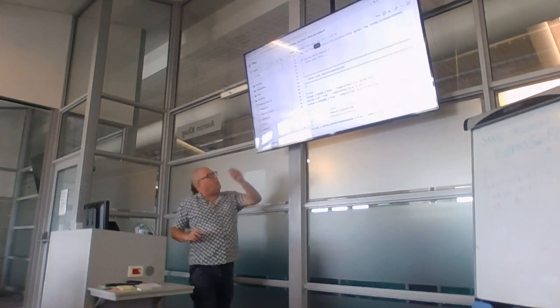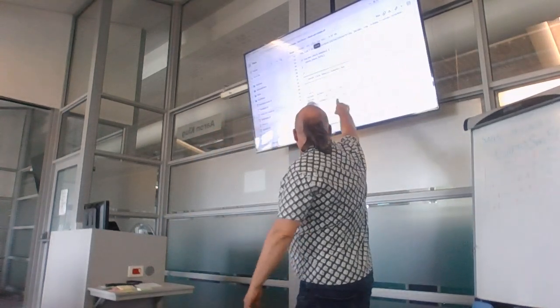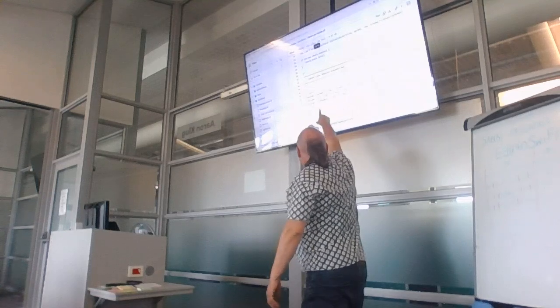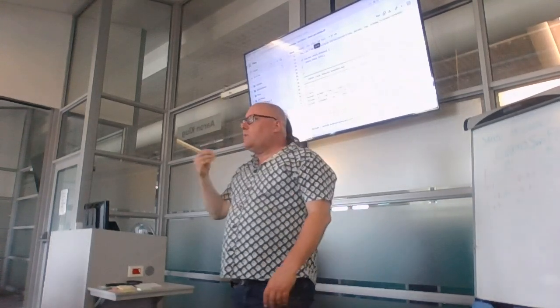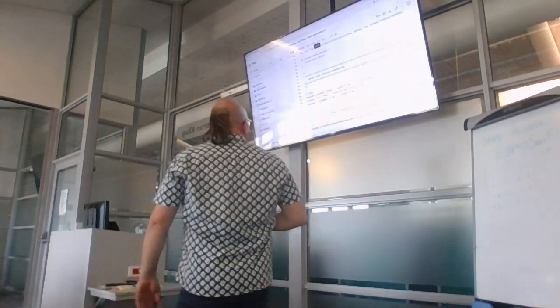It says import local workflows, okay? So it says here include gather from, and there's a name, include QC from, and there's a name, include scrubber from, and there's a name. So it's got three different modules that it's importing called gather, QC, and scrubber, okay? And the names give you a bit of an idea of what they do.